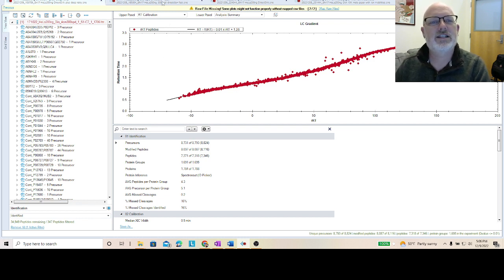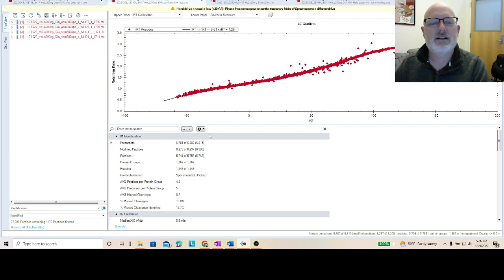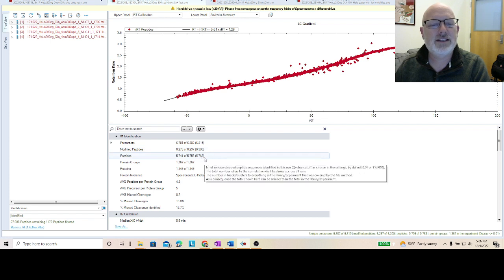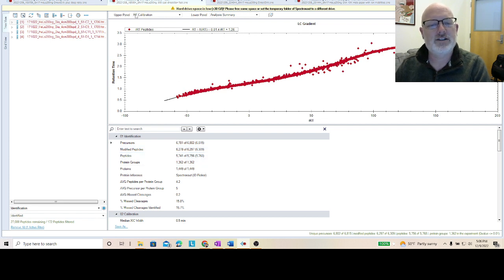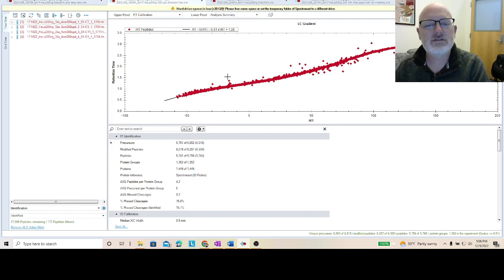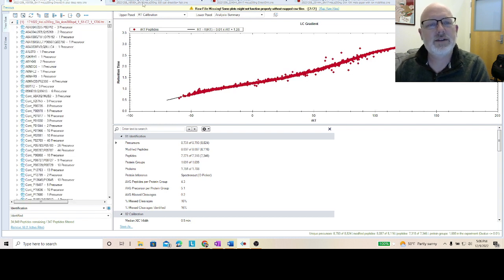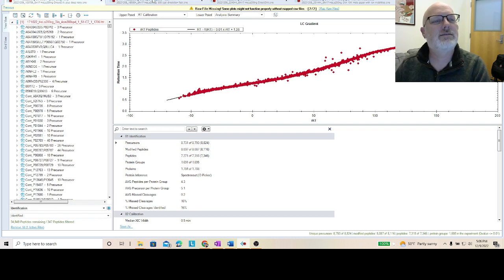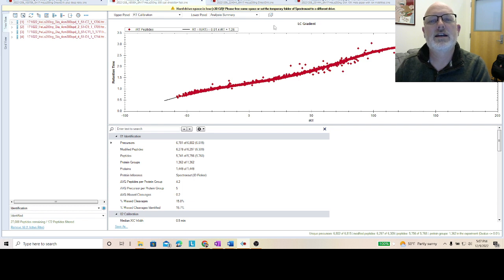If we do the directDIA fast method instead of deep, I assume it's faster. We drop by a little under 2,000 peptides, and to around 1,300 protein groups. So it drops from 1,600 to 1,300. So I don't know, what's that, 10%, 20% maybe? Yeah, that's about 300. Okay, so maybe a 20% improvement with the directDIA deep versus the plus.